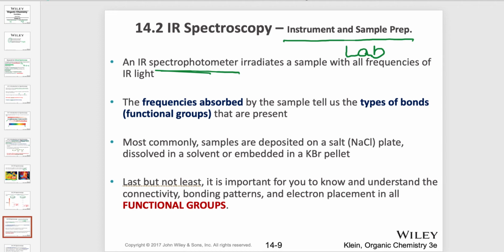Most commonly, there are different ways to prepare a sample. We can make a solution.